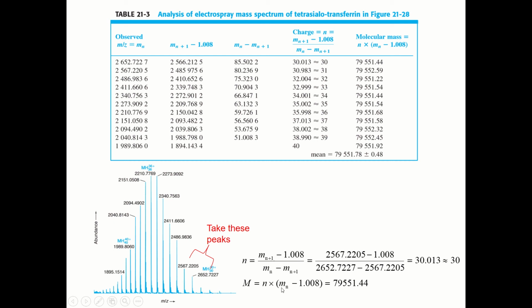By substituting all these values here, we get 30.013, which is almost 30. So we know this peak contains 30 protons in this molecule.